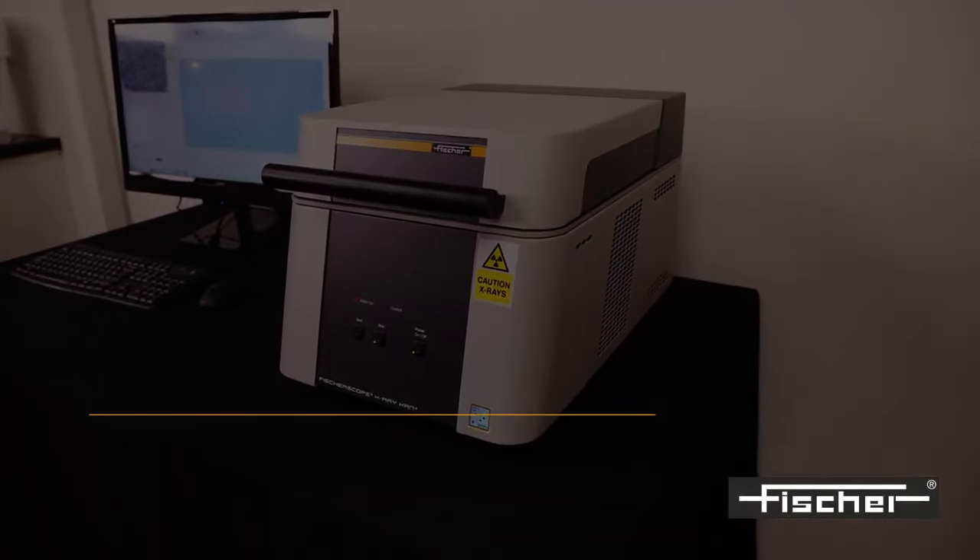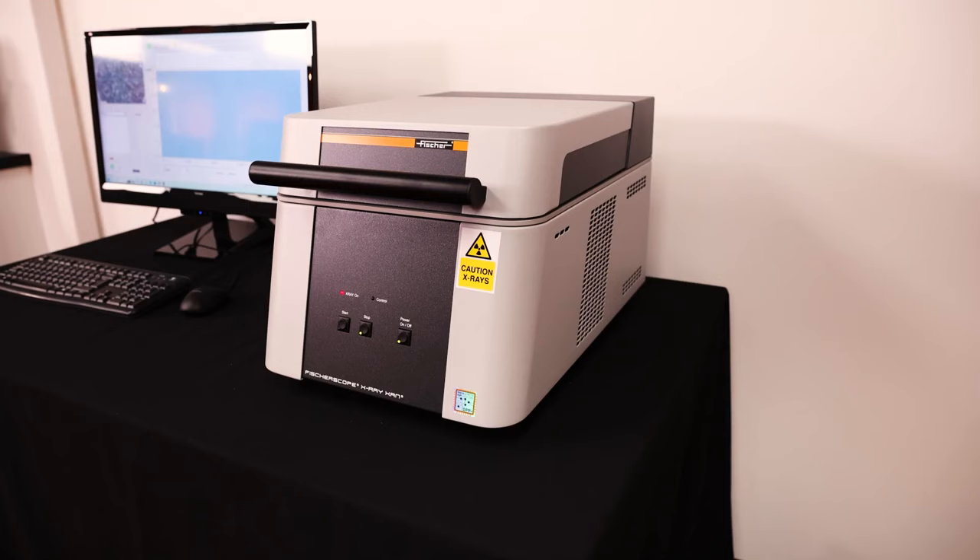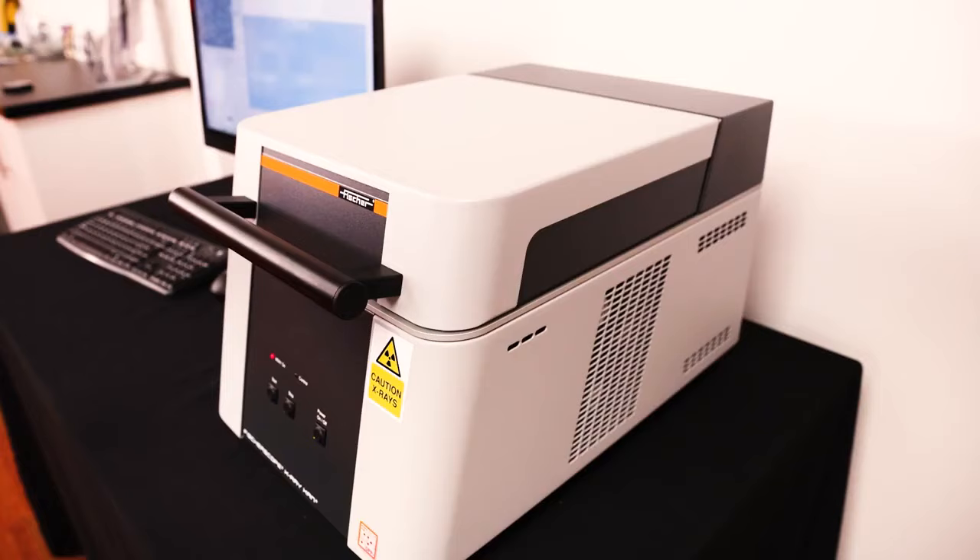Introducing the FischerScope X-Ray XAN 250. The FischerScope X-Ray XAN 250 is a compact, high-performance measuring instrument with universal application.